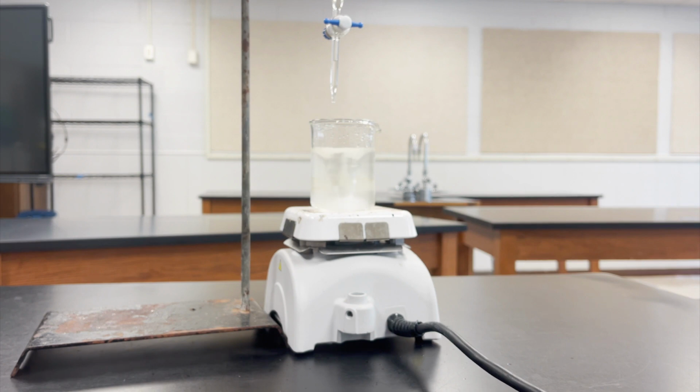Now we know that we're starting to get to the point where there's not as much acid, and the base is lingering around a little bit before it reacts with all the acid. And so let's go ahead and add half milliliter increments. Ooh, and it's really lingering there.